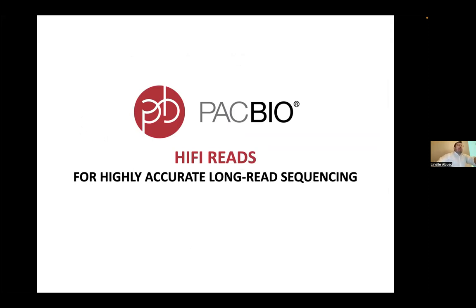So I'm going to talk about the PacBio HiFi data. Yesterday I was mentioning and describing PacBio data: how the sequencing is very processive, and the way the libraries are made with two hairpins on each side. So it's a linear library, but topologically circular. And now we're going to see why it's very important for PacBio. Without it, PacBio will have an error rate of about 15%.